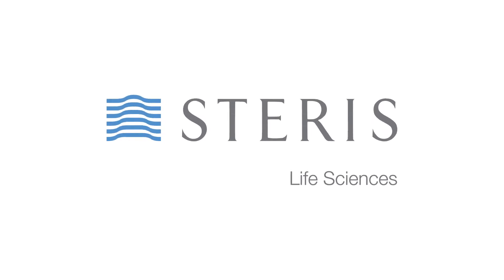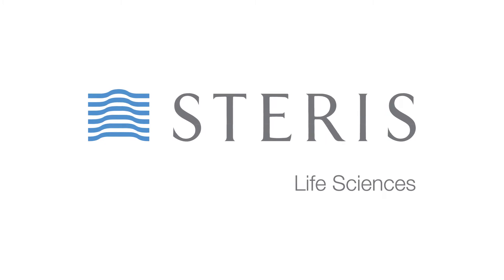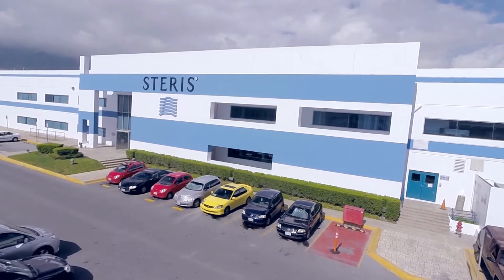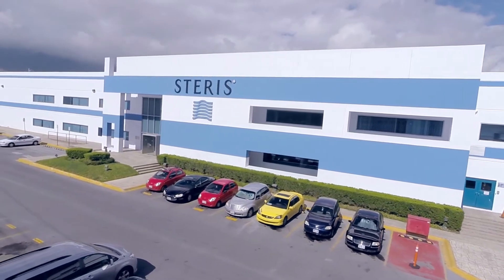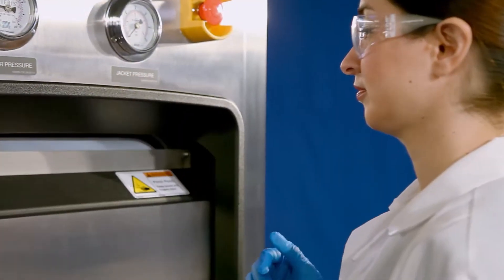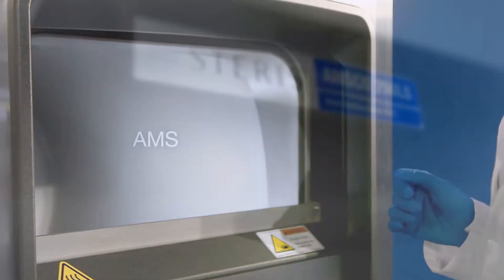For over 100 years, Steris has been a global leader, trusted partner, and solutions provider in the field of sterilization and contamination control, offering steam sterilization equipment and application engineering to ensure unsurpassed efficacy to meet all of your sterilization needs.